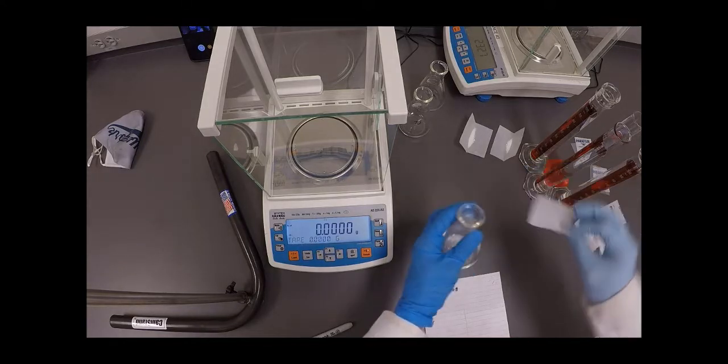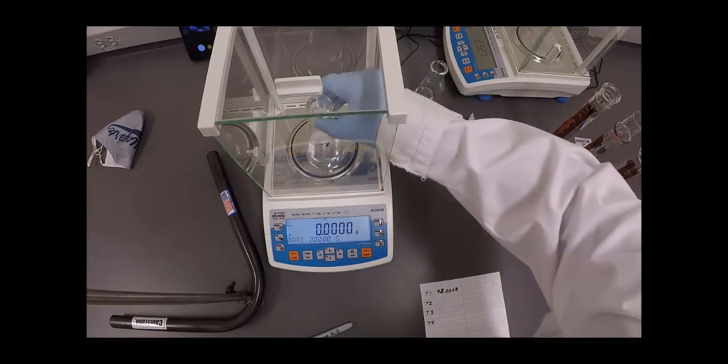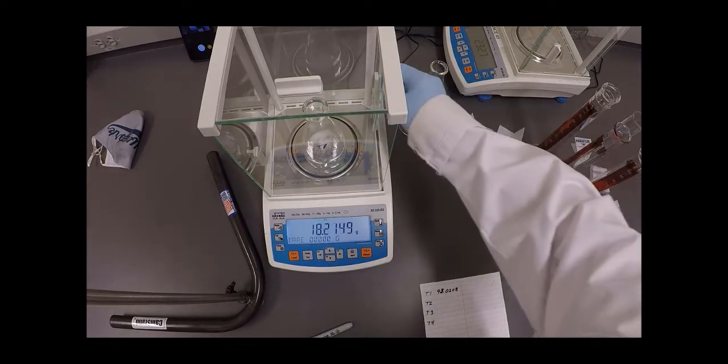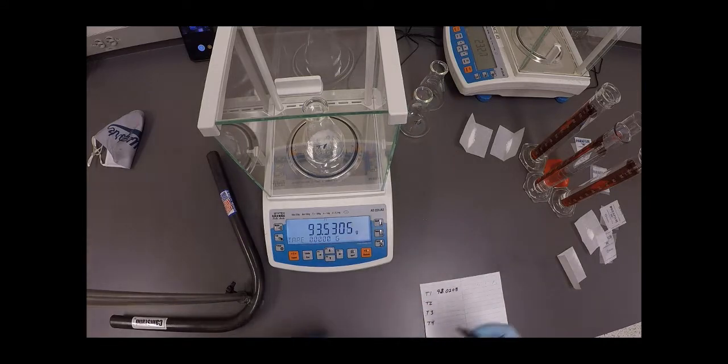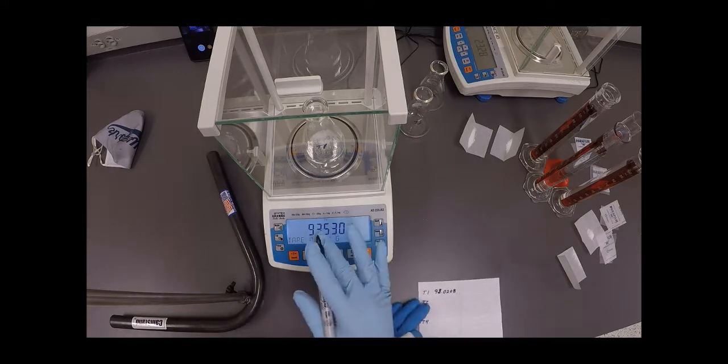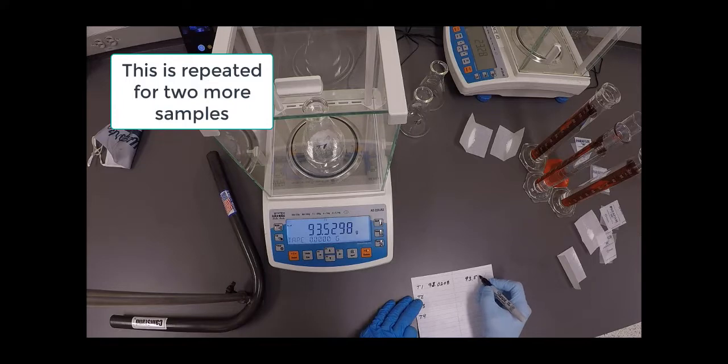And now I'm going to add approximately a half a gram of KHP to this. So again, this will give me my gross mass, and you'll get to take the difference between what I read here and the empty mass of the Erlenmeyer to get my mass of KHP. So the gross mass of the KHP plus the Erlenmeyer is 93.5298.